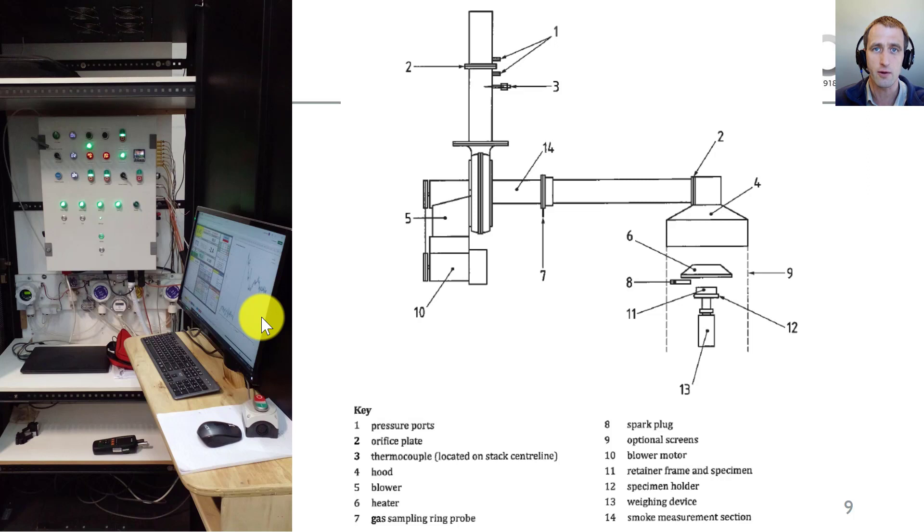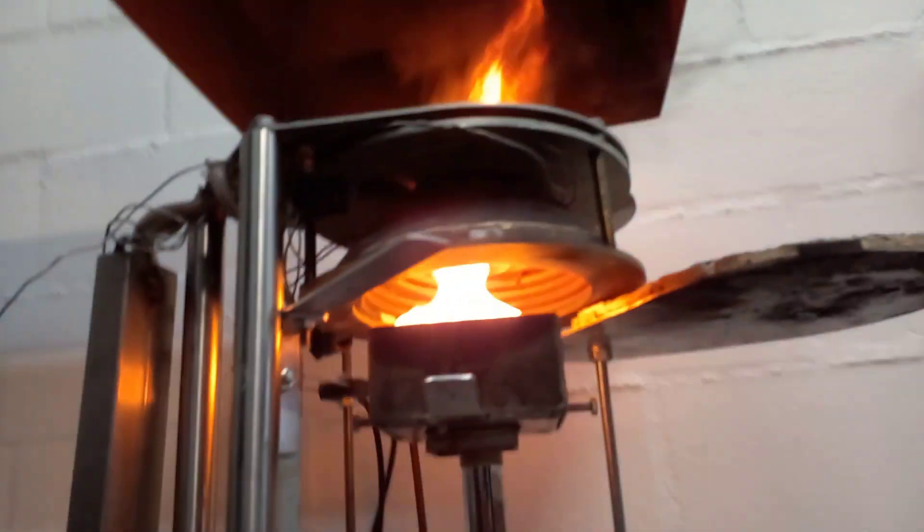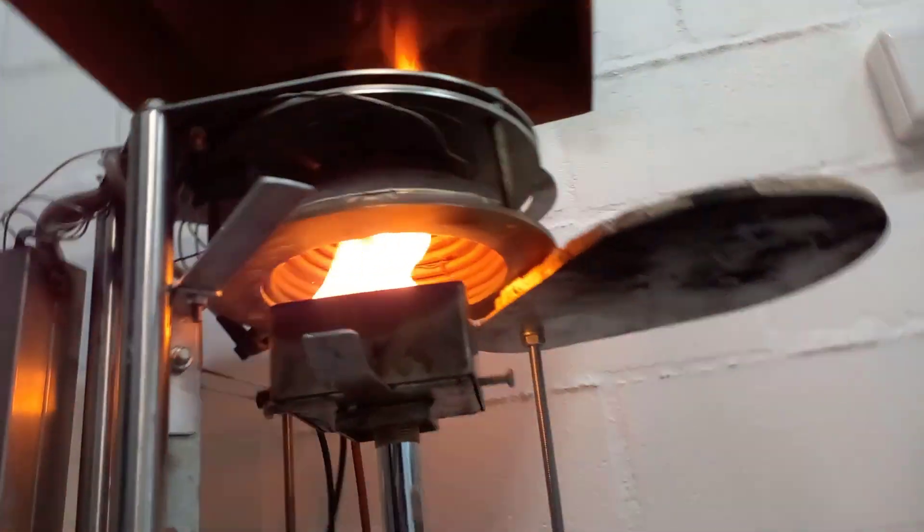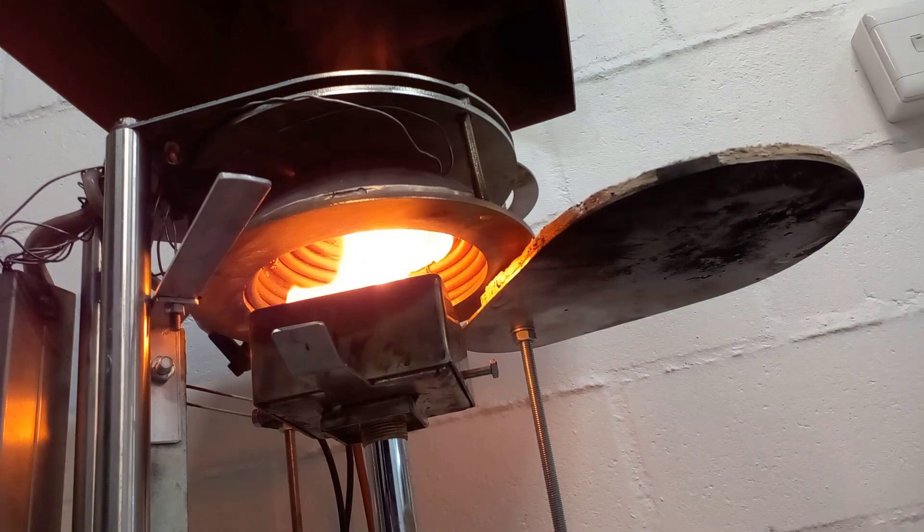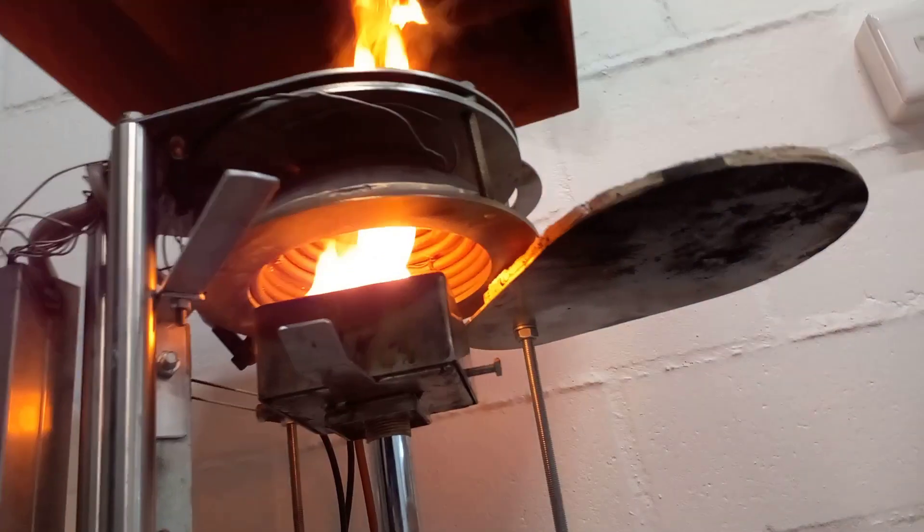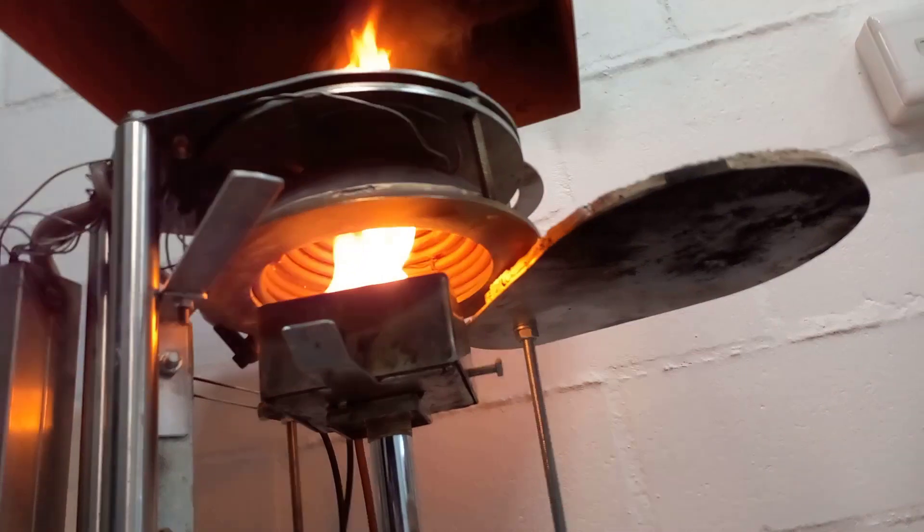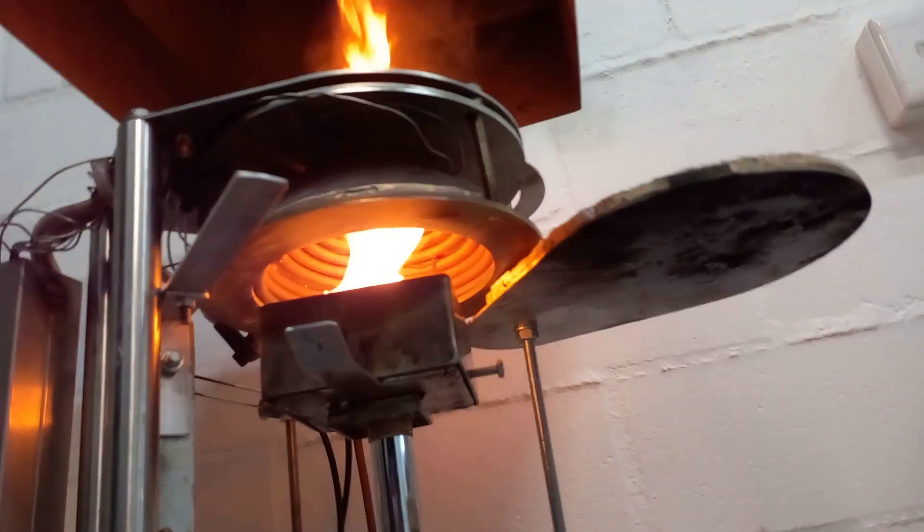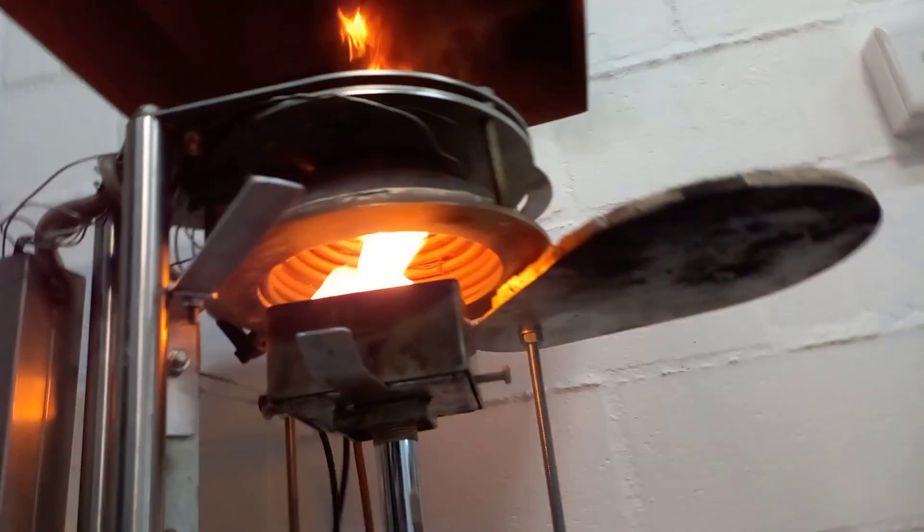Here you see the cone, which is heated up to many hundred degrees Celsius. The temperature is controlled to emit the correct flux, and that is calibrated. That flux is then emitted onto the sample below, and that might be 10, 20, 50, or 75 kilowatts per square meter being emitted from the cone.